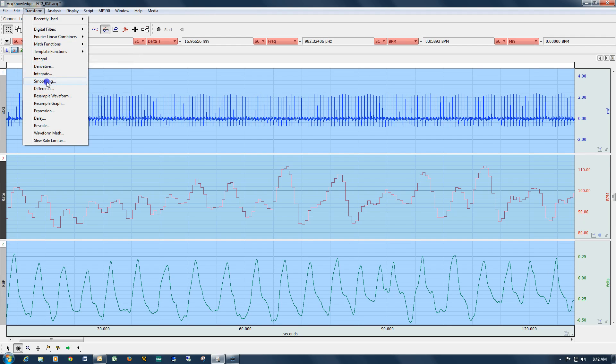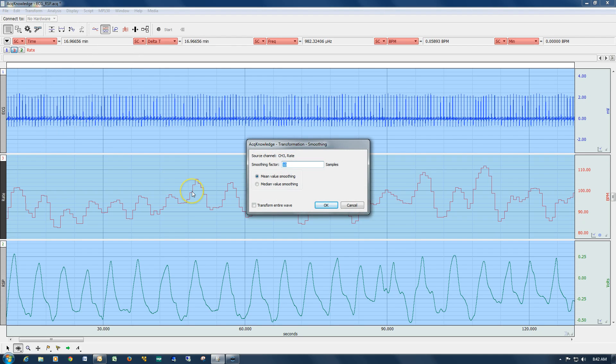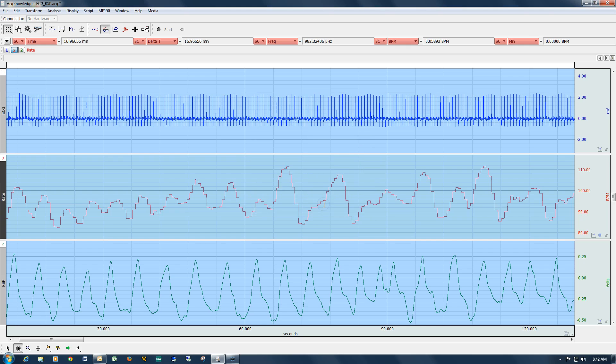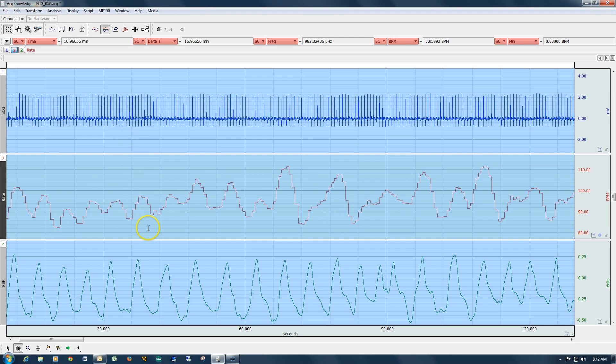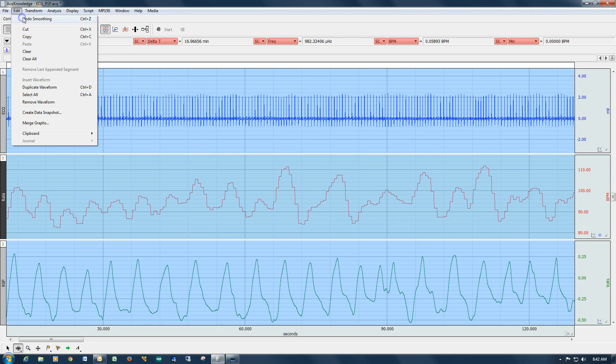But if we just increase this up now, let's take a look at 100 samples for example. You can see we've just started to take some of these edges away. We're starting to smooth it, but clearly 100 isn't enough.